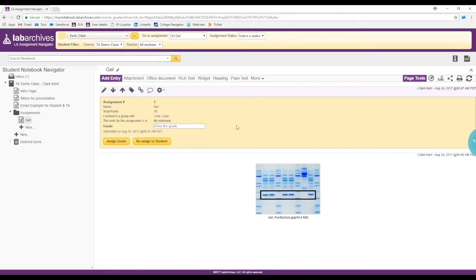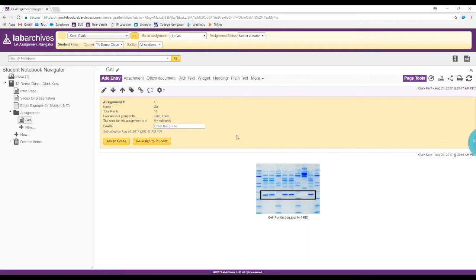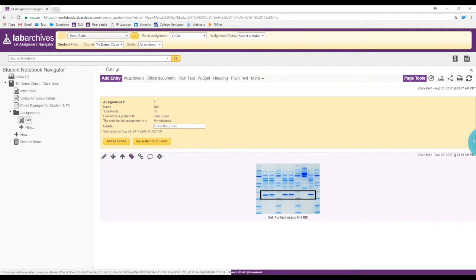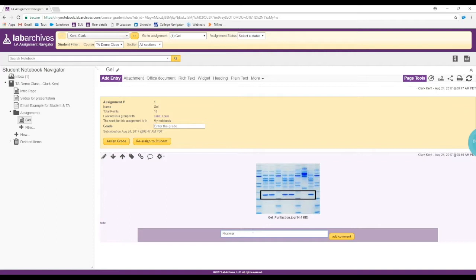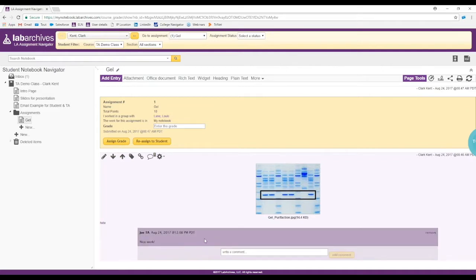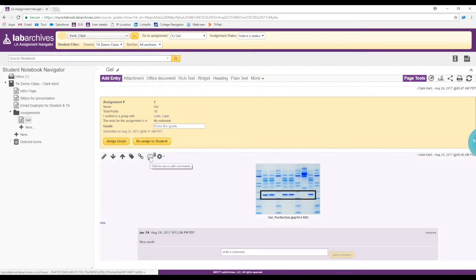Now let's talk about how you can do some mentoring activities within the student notebook. If you hover over an entry, one of the icons is a little comment bubble. You can be in Clark Kent's notebook, click that comment bubble, type in a comment like 'nice work,' and add it. This comment is not a permanent entry — it's a casual dialogue between the instructor or TA and the student. The student can also click it and ask questions, like raising their hand.